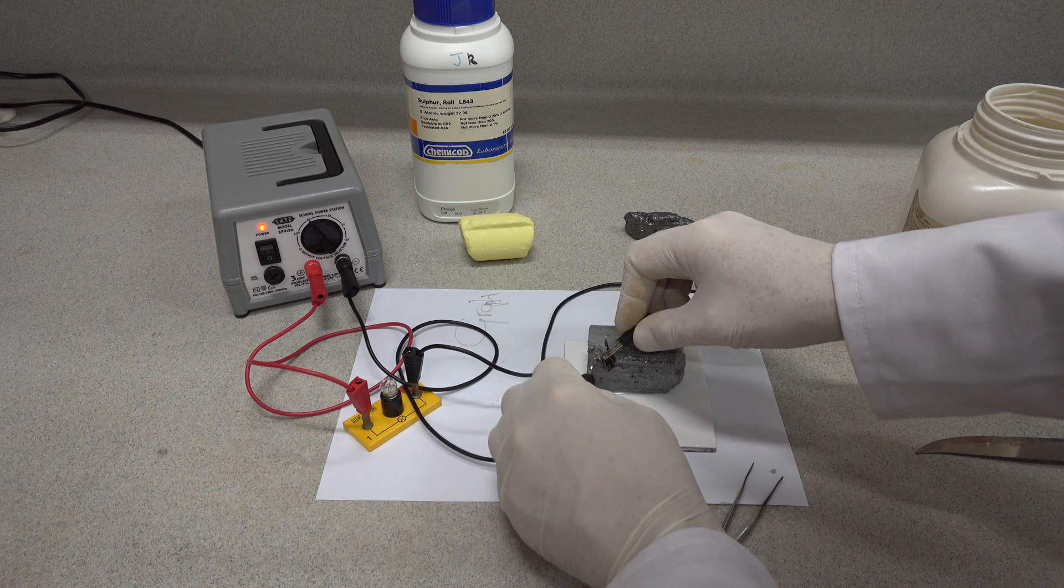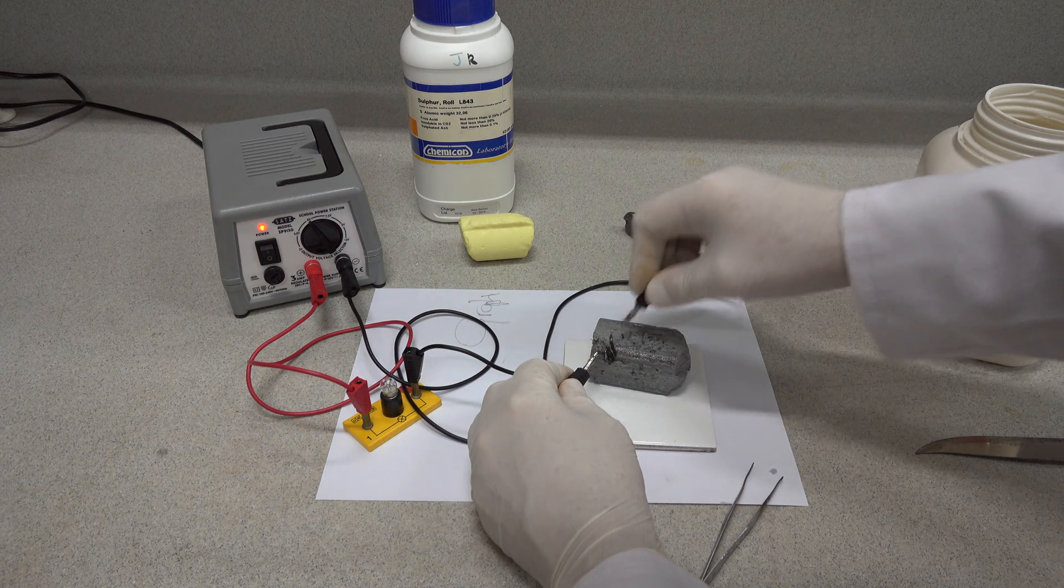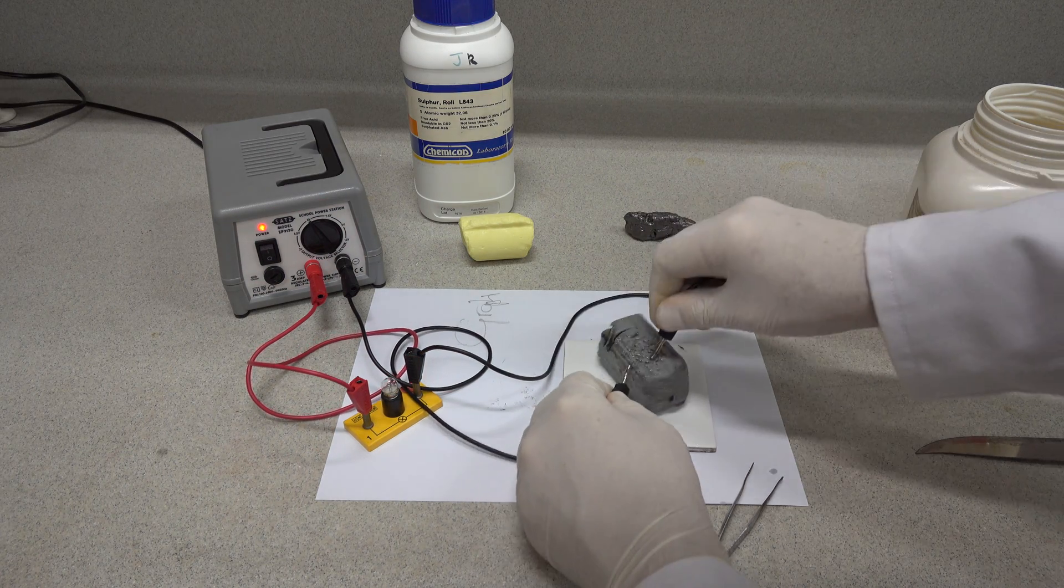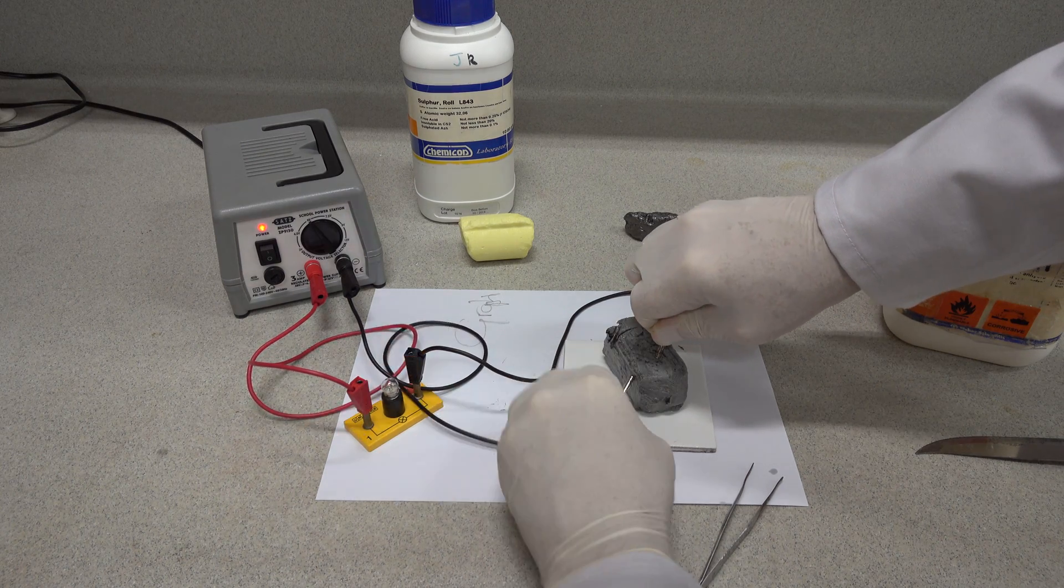Here's lithium. And you might see, yes, either side of the contacts there, we can get the lithium to light. Can we get it across the metal? I presume not because of the oil that's surrounding it.